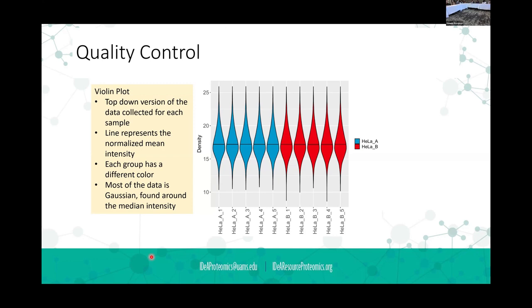Yeah. So not just normalization, I think if your treatment is having a big impact on, let's say, low abundant or very long-lived or highly abundant proteins, you can see it from this kind of data, right? You can. So this is not just a normalization tool, it's actually results. Yeah. Yes. These we moved on to results here. This isn't just normalization. We did the normalization, and then we applied that, and these quality control plots here show the normalized intensities.